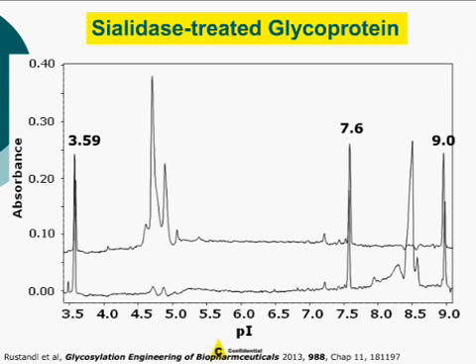And then in order to confirm that all the peaks that we saw in the electropherogram were due to differences in sialic acid distribution, we treated the protein with sialidase A, an enzyme that specifically removes sialic acid. An unsialylated EPO protein has a theoretical pI of 8.4, and you can see here in this figure that when we treat the protein with sialidase, all the peaks between about pI of 4.5 and 5 disappear, and we see this new peak that forms at approximately pI of 8.5, indicating that the peaks that we see are due to differences in sialylation.